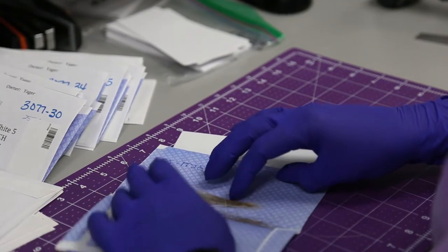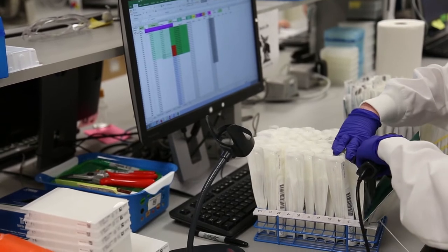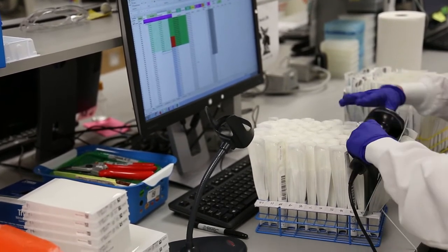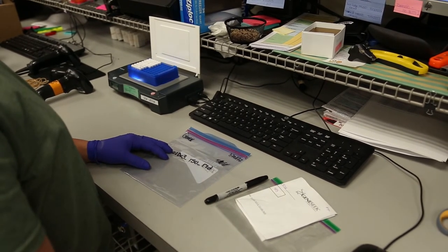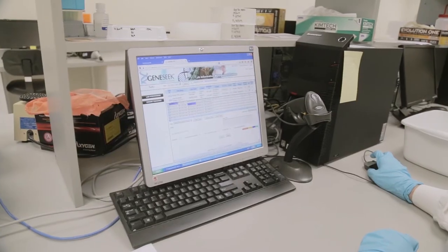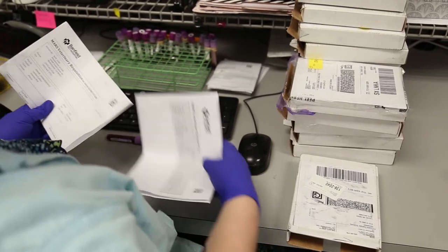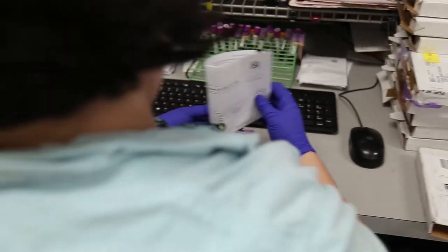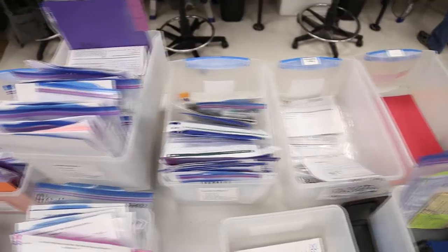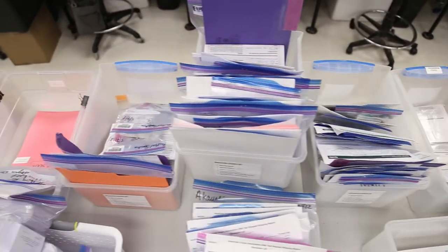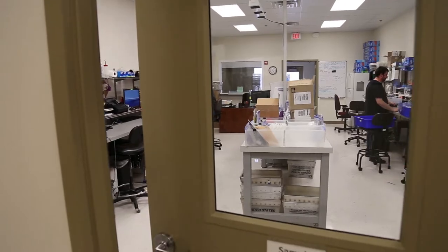When the materials arrive at sample reception, our group logs every item into our system, giving each a specific ID that follows it from beginning to end. A tool called the Laboratory Information Management System tracks the hundreds of thousands of tests underway. It records essential information about each sample and sets up the testing to reveal DNA encoded in the sample. Think of sample reception like a giant funnel, gathering many thousands of samples each day from many species of animals and plants.